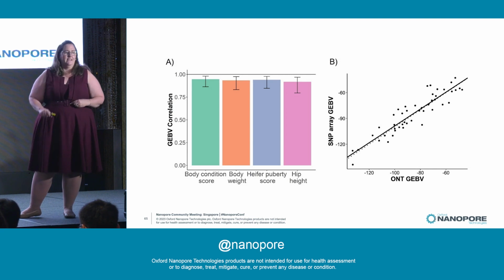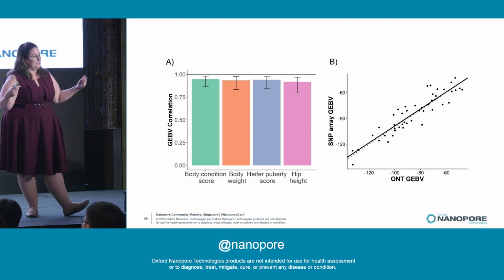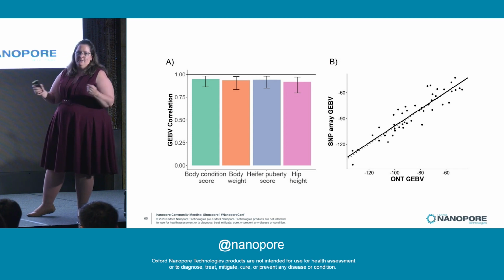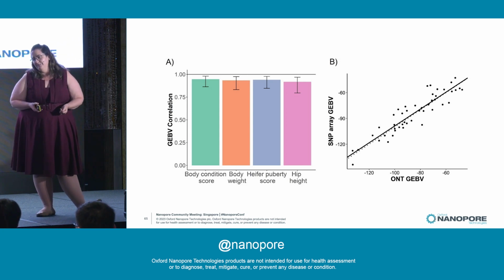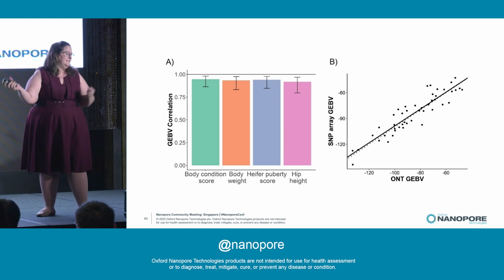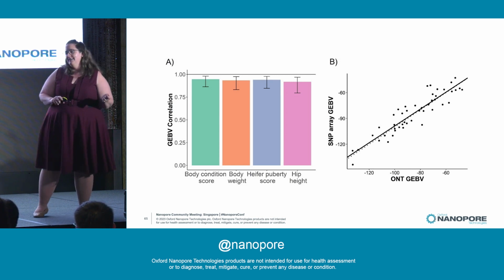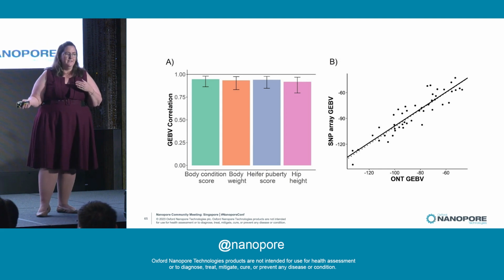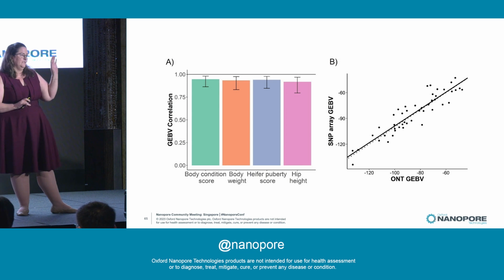The other thing that he wanted to look at is bias, because we don't want to be using nanopore sequencing and introducing systematic bias into our results, right? Because every technology has a systematic bias, and we want to make sure that we're not giving the farmers artificially high or low values. And so that's what you can see there on the second plot. The dotted line is a perfect match between the SNP array genotyping and the nanopore-based genotyping. And the solid black line is the correlation that he got. And you can see they sit on top of each other. That means that there's no systematic bias, whether you're making breeding values using a SNP array or whether you're making breeding values using low-pass nanopore sequencing.